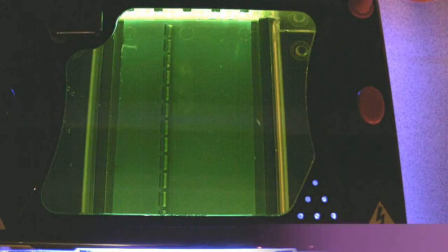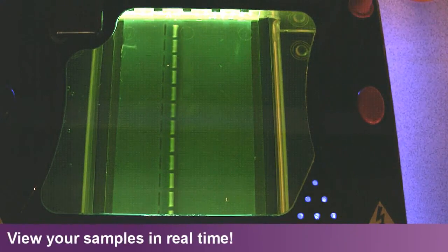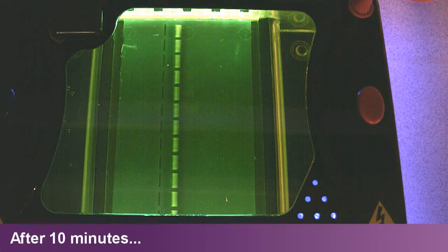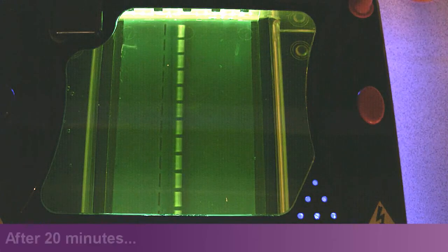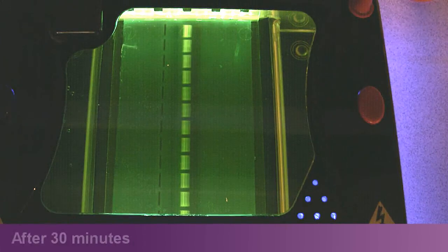Blue light has none of the mutagenic effects of UV transillumination that compromise DNA cloning efficiency. RunView's capacity to provide real-time visualisation of electrophoresis gives the user complete control in tracking DNA migration through the gel.